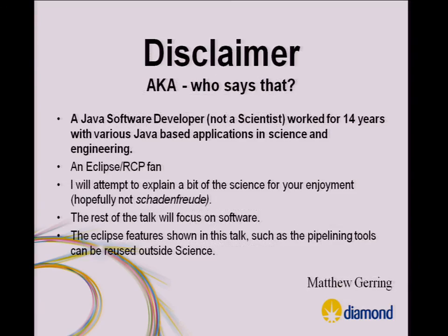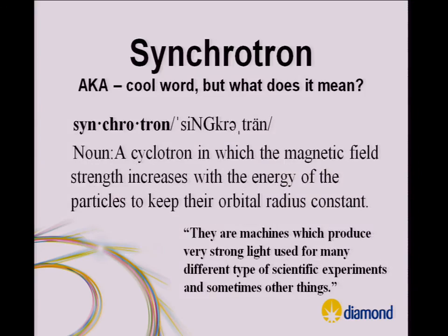Who am I? So I'm not a proper scientist, but I'm going to lecture you all about science. I'm a software developer, worked in Java for a while, mostly in engineering applications, all over the spectrum really. But for the last 4 years, I've been working with this synchrotron data. I'm a fan of Eclipse. I'm going to try and explain some of the science, hopefully not for your Schadenfreude. And then we'll look at the software.